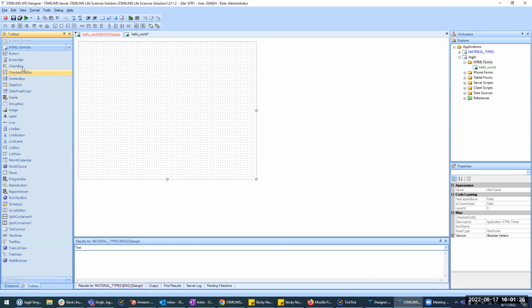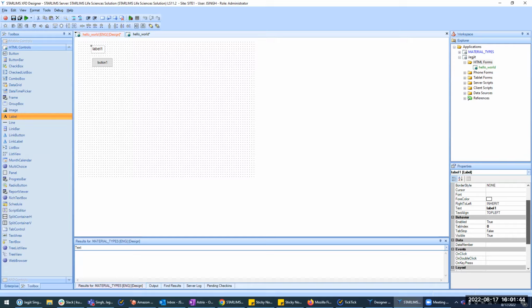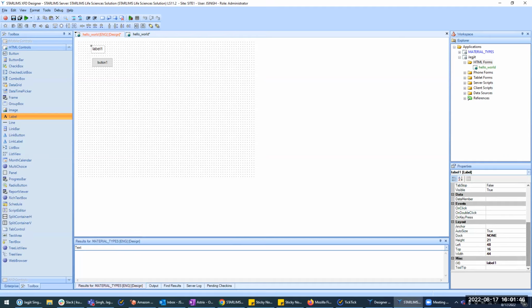Click on that, and the button is first. And do a label as well. Then the label should say hello world. So there you go, without much training. I'm going to let him figure it out.